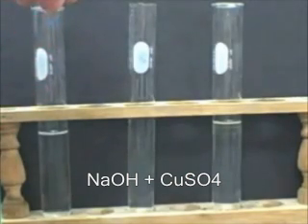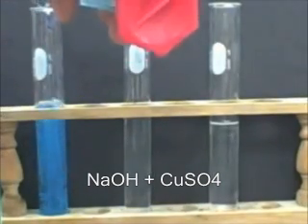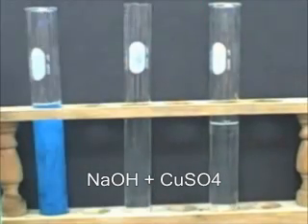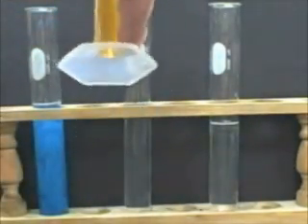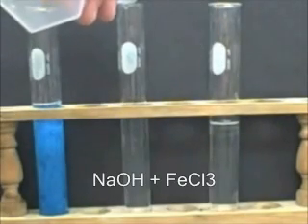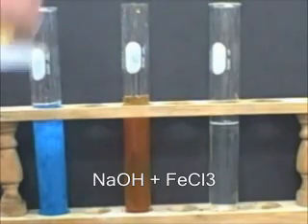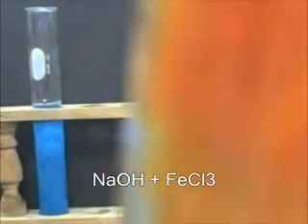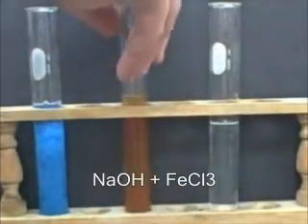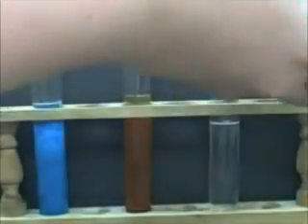As we see in the solubility rules, all metal oxides or metal hydroxides are insoluble except for group 1A compounds. So we see the copper hydroxide forms when we add copper sulfate to the sodium hydroxide. In the second one we have sodium hydroxide and we add iron chloride, and we see the iron hydroxide forming a precipitate. The precipitate is identifiable usually because you can't see through it. Sometimes you might form a gelatinous, more gel-like precipitate, but in these cases you see clearly the precipitate that's forming.